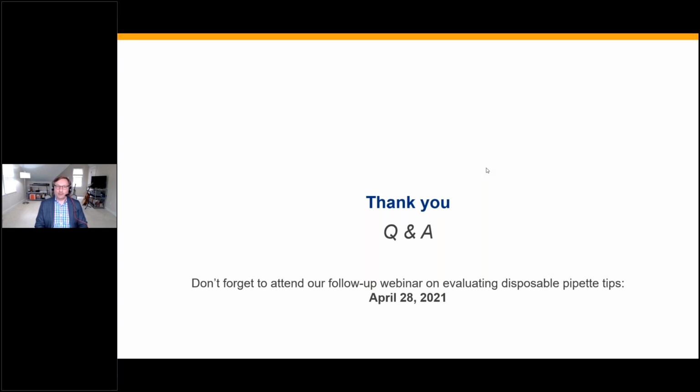You could take it apart, and if you have multiple things going into a well, let's say you have 3 dispenses going into the same well. You potentially could have 2 of the dispenses doing diluent, and then the third would be doing a red dye, and then you could alternate that with the other dispenses in there. That's how I would do it, and I've been pretty successful breaking it apart that way. It goes to the same flow that you're working with, and you can get some pretty interesting numbers actually. But I'd say follow up with me after the seminar. I'd be happy to talk with you on that.